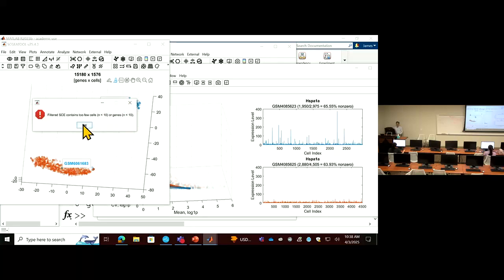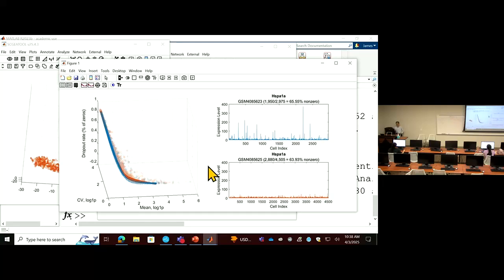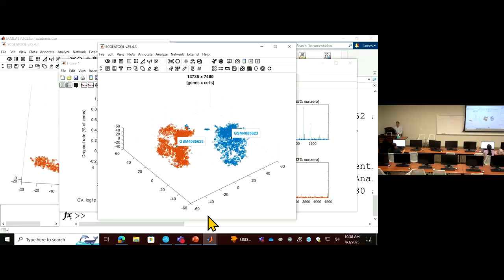Because the number of cells is still small. Yeah, so there's some problem with this human example. What I can do is upload this to the channel, so if you want to download, you can have that.